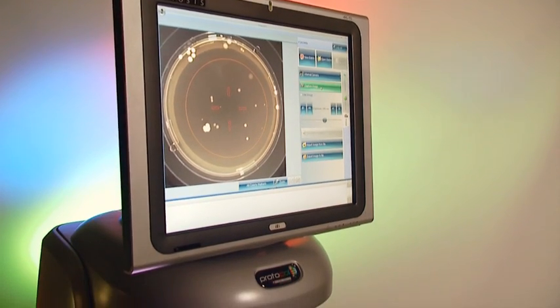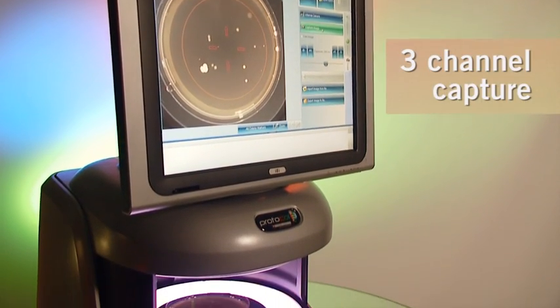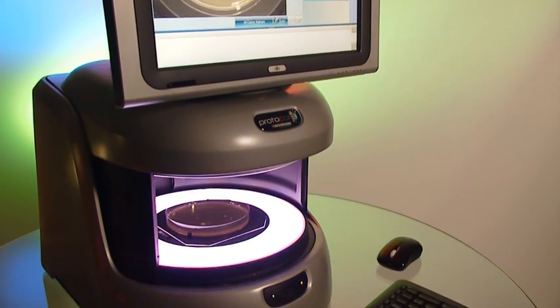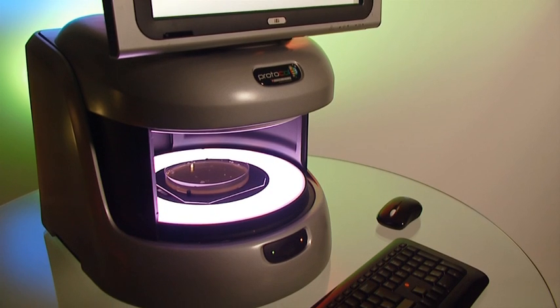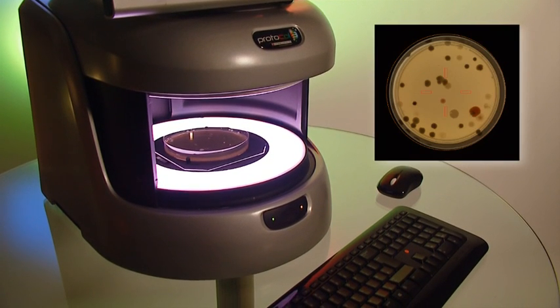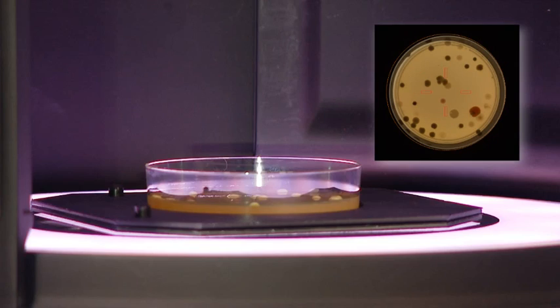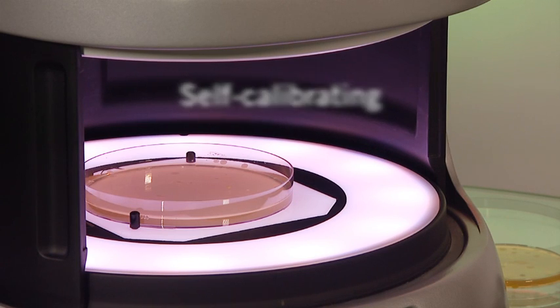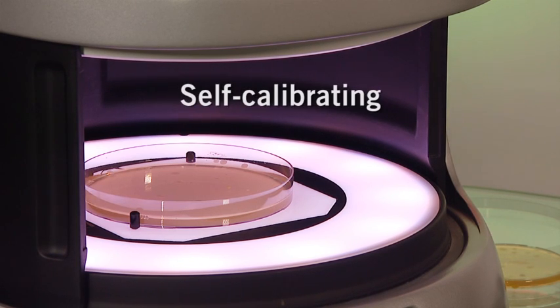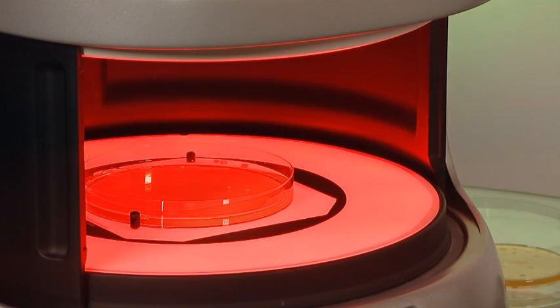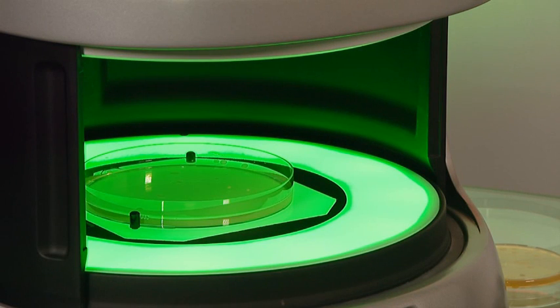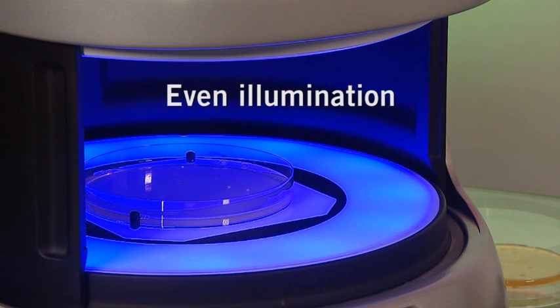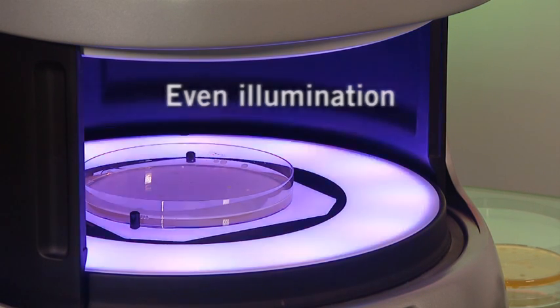By taking three separate images under colored lighting, the software recombines each one and converts the result into a colored image. The system is also self-calibrating and the patented lighting system with three channels of LED light gives even illumination of all sample types.